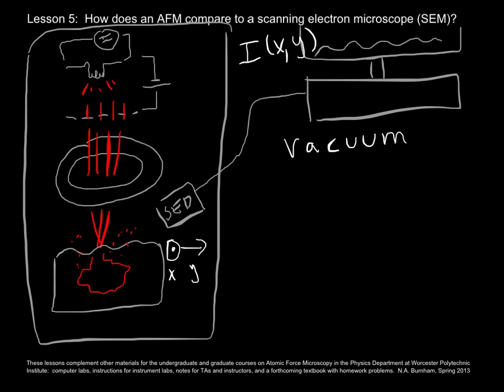And you know that like does not like, right? Like charges repel, and so if the sample is not a conductor, this system will not work. So you must use conducting samples. And typically, if you have a non-conductor, what's done is you coat the non-conductor with a thin layer of a conductor, gold, for example.